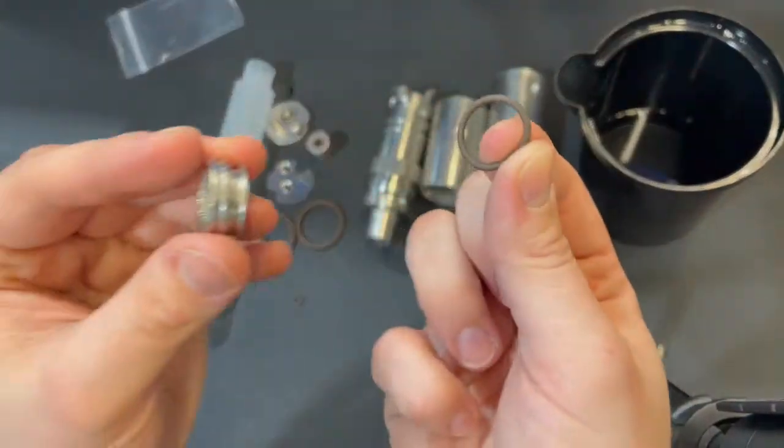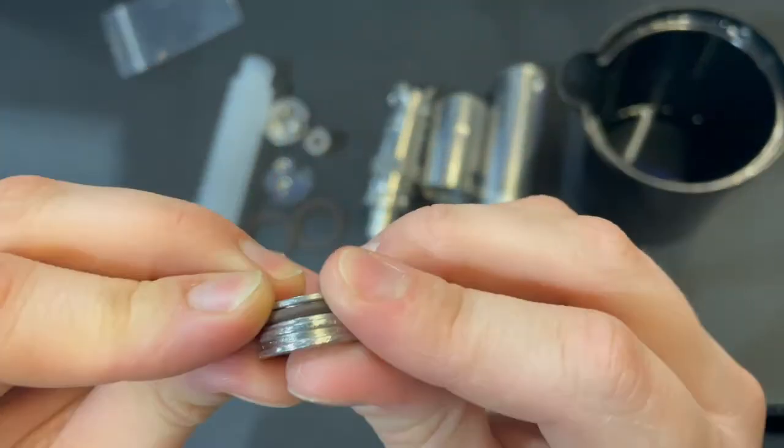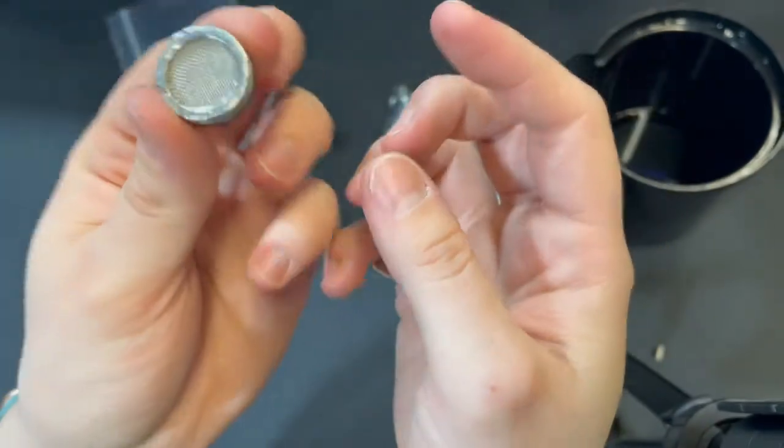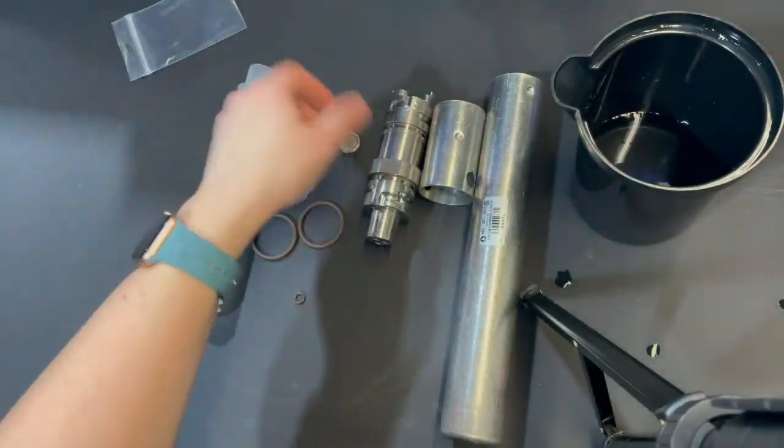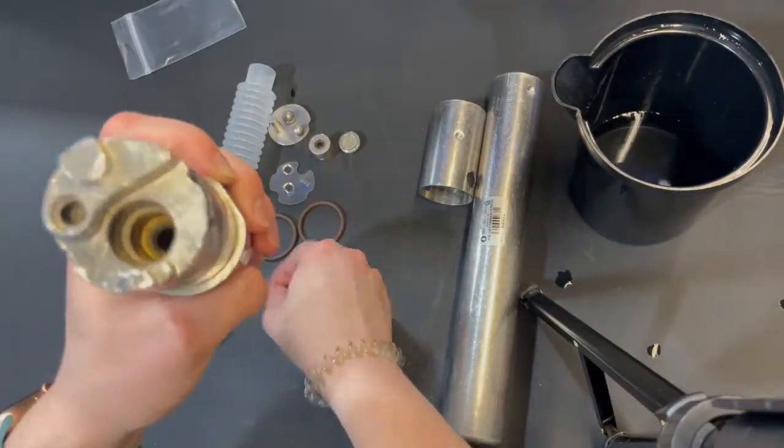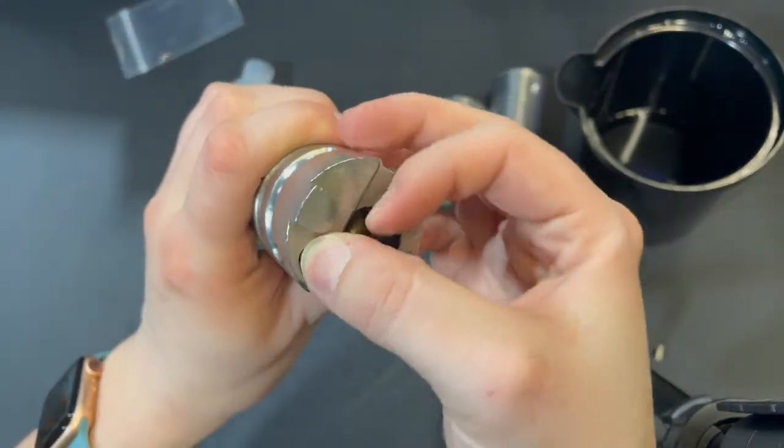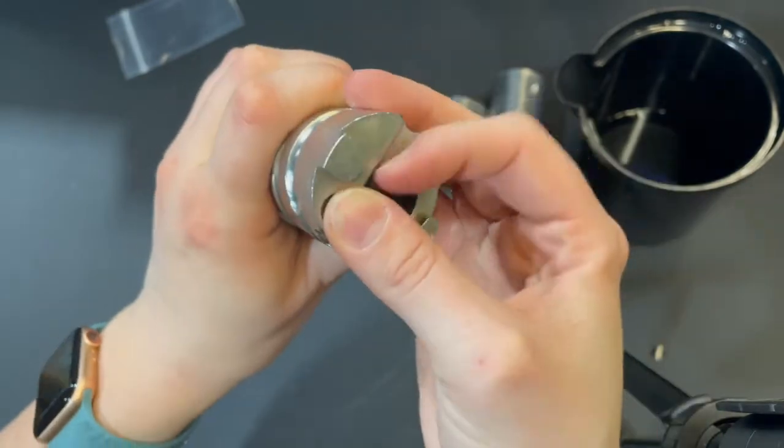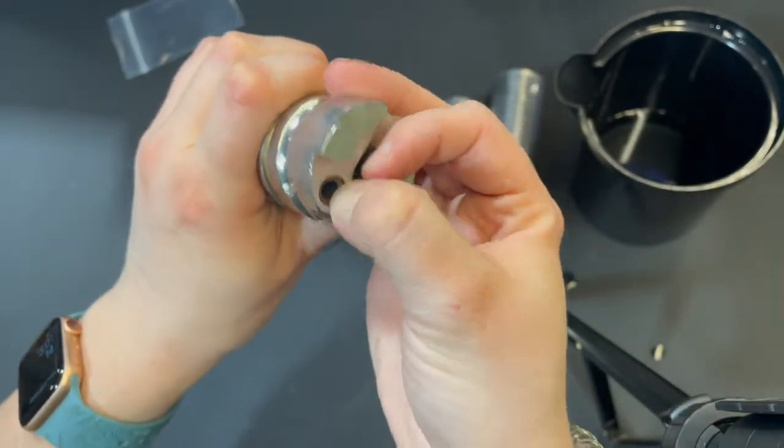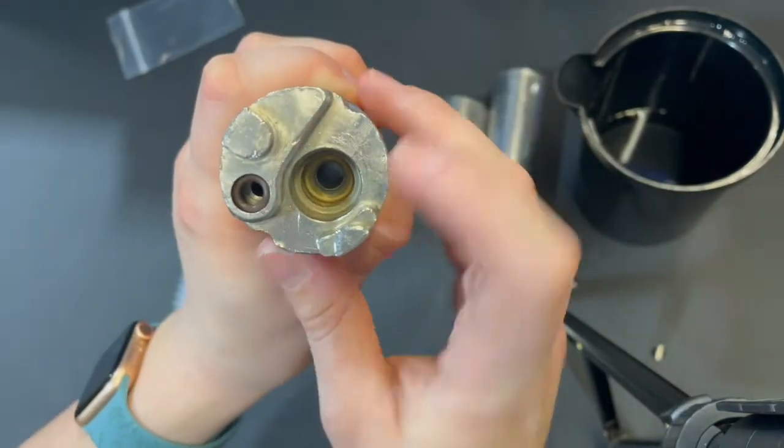Then we're going to take a medium o-ring and stick that into the outside groove of this piece. Then we're going to put this small o-ring into the top in this small hole until it sits flush. Make sure that it's not bent or crimped in there.